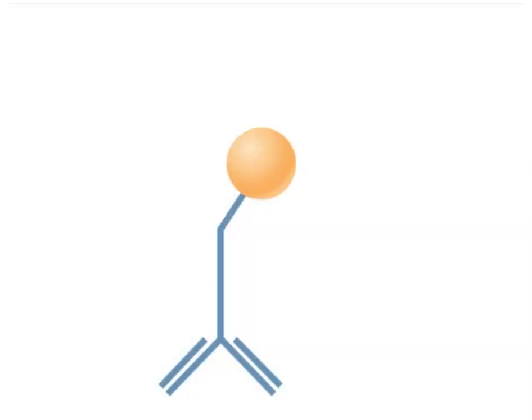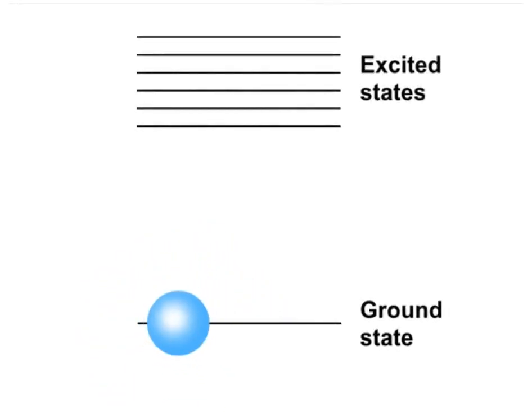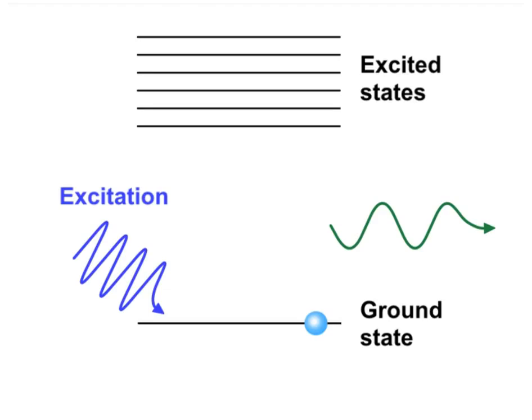Fluorescence is a phenomenon that takes place when a substance absorbs light at a given wavelength and emits light at another wavelength. Fluorescence occurs as an electron, which has been excited to a higher and more unstable energy state, relaxes to its ground state and gives off a photon of light. The light that is responsible for excitation, or moving the electron to a higher energy state, is of shorter wavelength and higher energy than the fluorescence emission, which has a longer wavelength, lower energy, and different color.